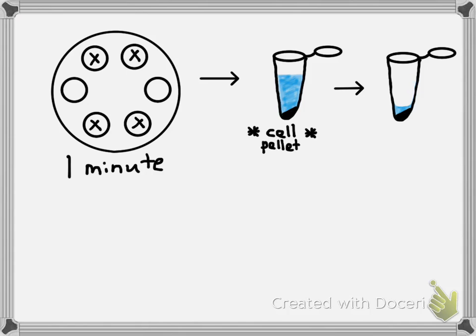So we need to get rid of most of the liquid layer called the supernatant. It is important to do this very carefully so you don't lose the pellet. If you do, you need to start over. You can draw out the liquid with your pipette, or you can try to pour off the supernatant back into your cup.